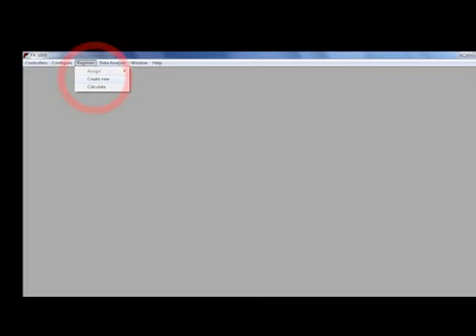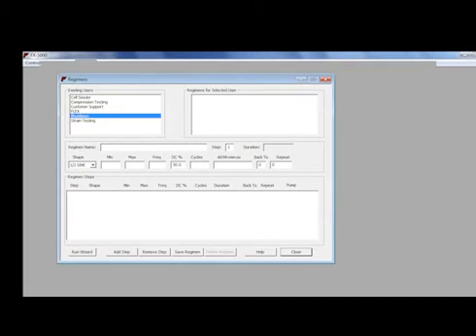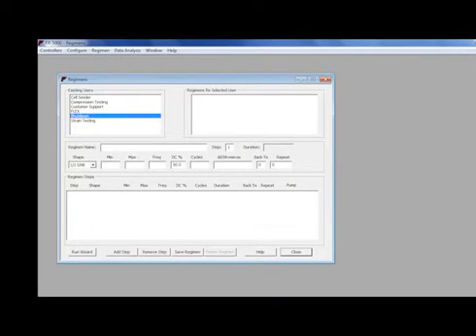From the Regimen drop-down menu, select Create New. In the Existing Users box, choose Shutdown.